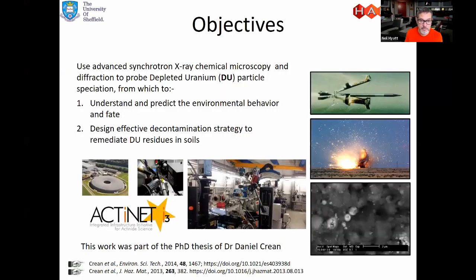The talk is split into two parts and is based around using multimodal microfocus X-ray spectroscopy to characterize depleted uranium particles for munitions testing. The first part applies these techniques to understand the environmental behavior of DU particulates. In the second part, we apply these techniques to design more effective remediation measures for DU contamination.